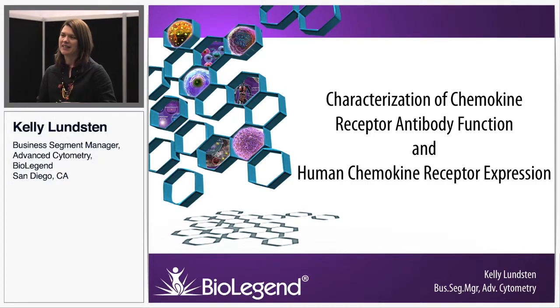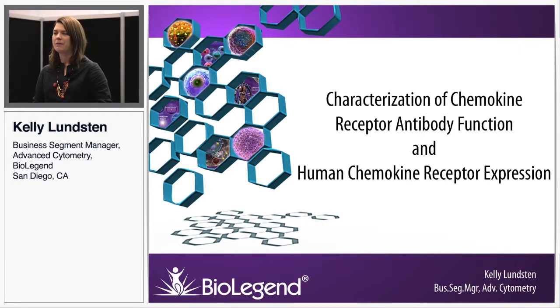My name is Kelly Lundsten. I'm the Business Segment Manager for Advanced Cytometry for BioLegend. It's kind of a complicated name for simply saying that I help one of many people at BioLegend advance new technology. So I routinely do about 12 to 16 color flow cytometry, and a lot of my seminars tend to focus on the different pain points of doing multicolor flow cytometry. My expertise is actually in fluorescence chemistry, largely the development of the brilliant violet dyes, so I will talk a little bit about that today as well.